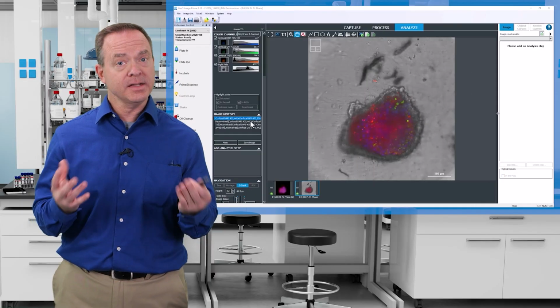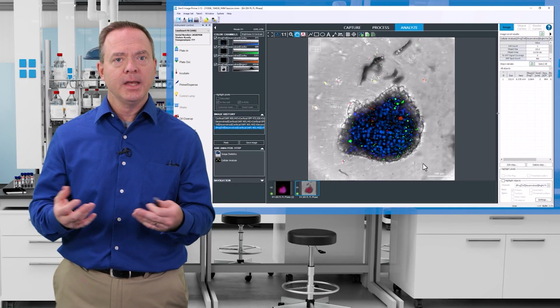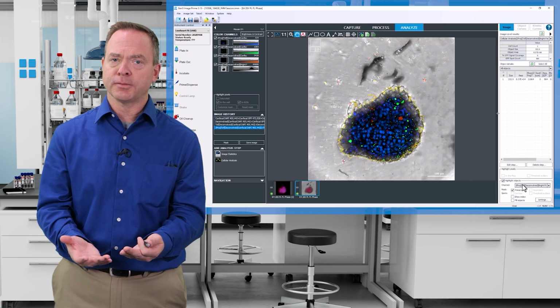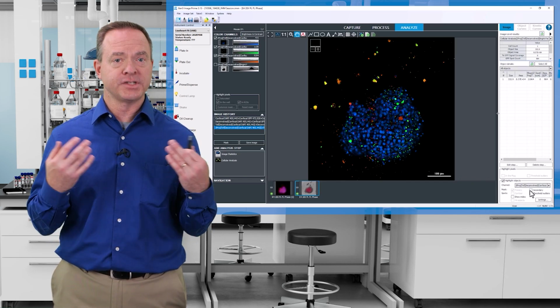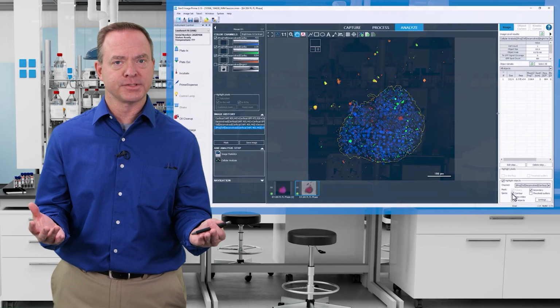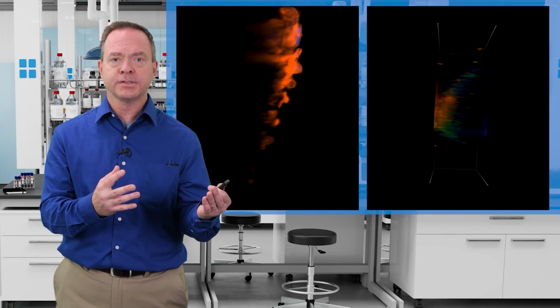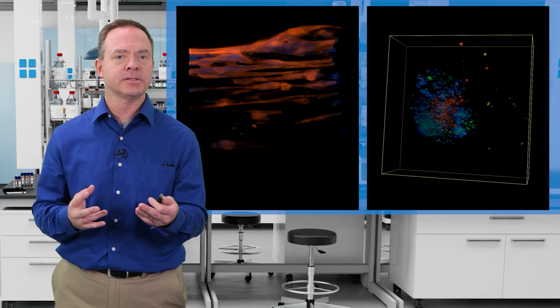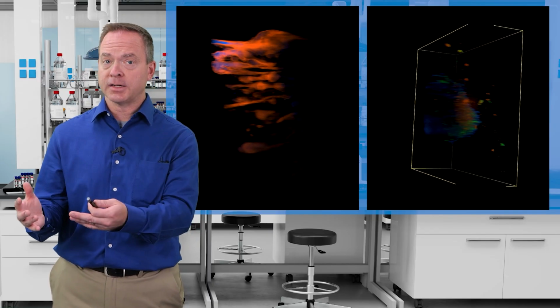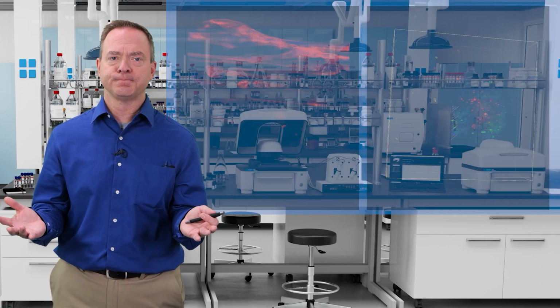Finally, more advanced microscopy, such as upright or confocal imaging, takes us another layer deeper, particularly as many labs move towards more physiologically relevant model systems. These models could include scaffolds, spheroids, whole organisms such as caterpillars, C. elegans, and zebrafish, plant models such as Arabidopsis, or other unique designs.